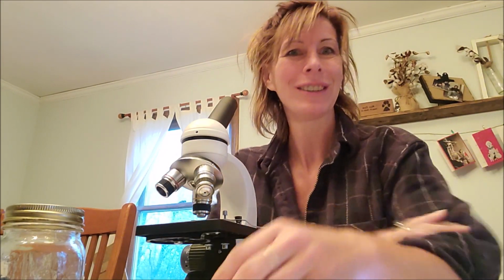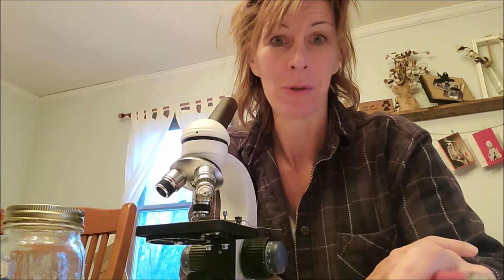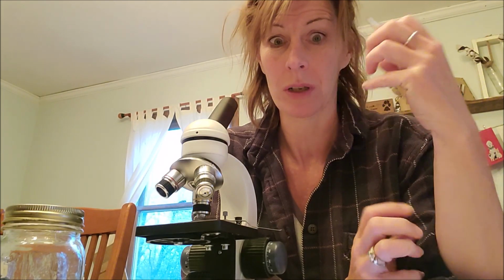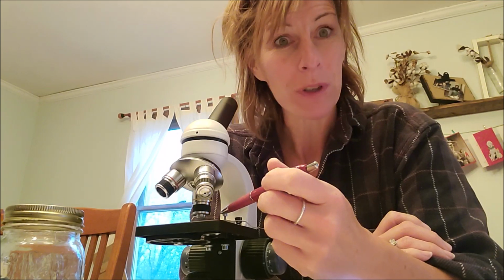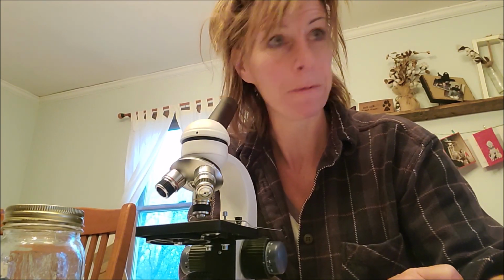Okay. Well, all done. What did you think? That's kind of neat, huh? So what I found was mostly the strongyles, and those are the adults. You guys caught him just in time because the larvae haven't hatched into the adults yet. So his load is going to be insane if he wasn't treated anytime soon. So I found 14 on one side and 4 on the other side. So we're gonna add those up together, it's 18. And we're gonna take that number and we're gonna multiply it by 25, which is 450.